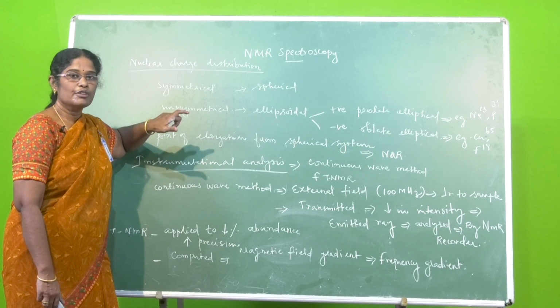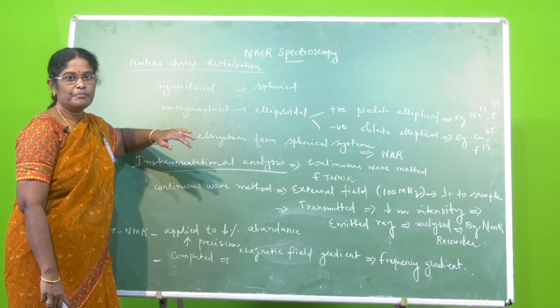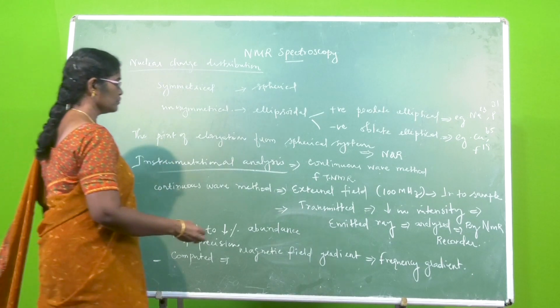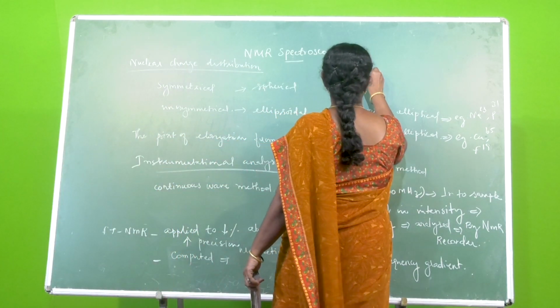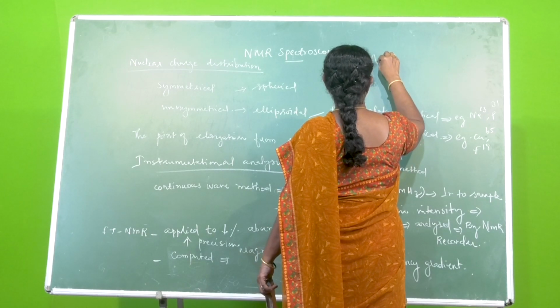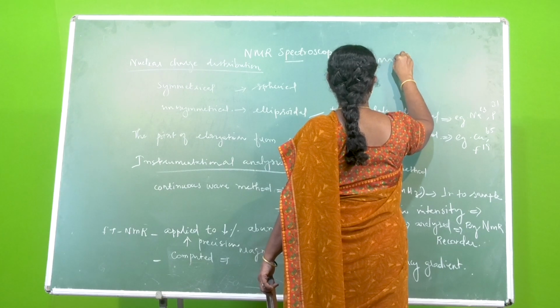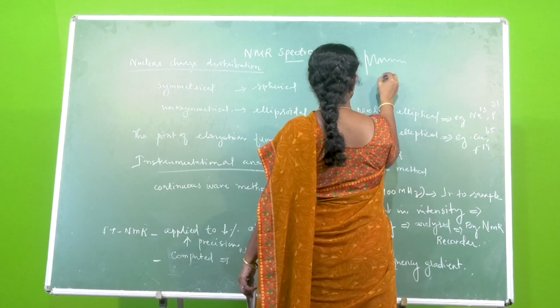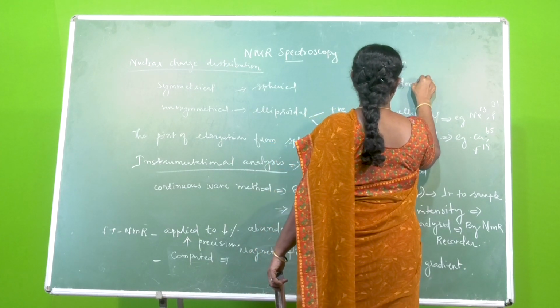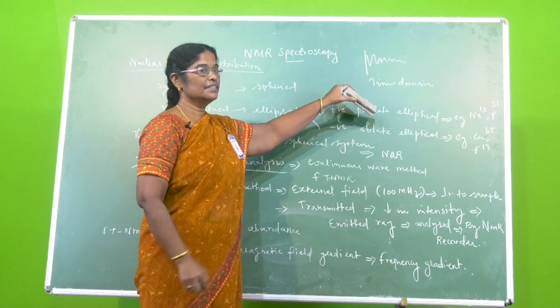One is an unresolved one, which is the outcome of the continuous wave method, one graph which expresses the field gradient as a decreasing parameter. This is referred to as a time domain graph. As time proceeds, what happens to the decrease in the intensity of the system?